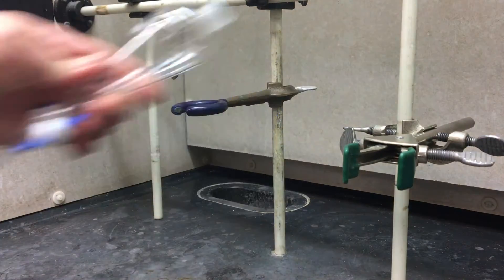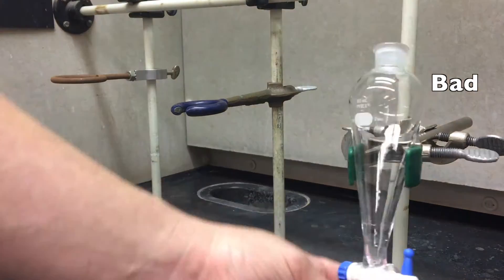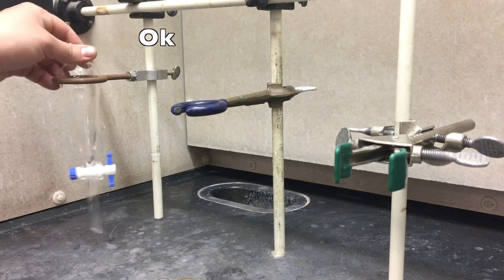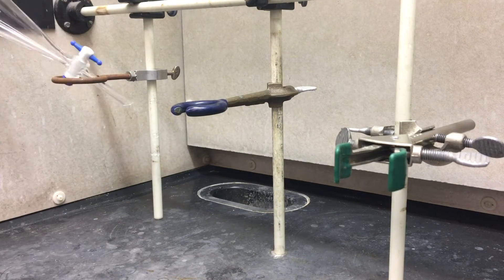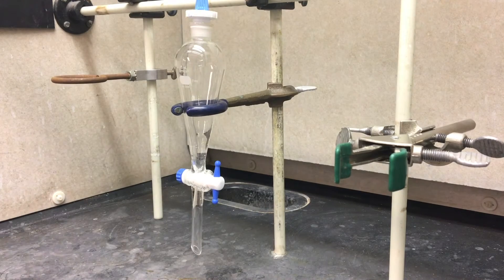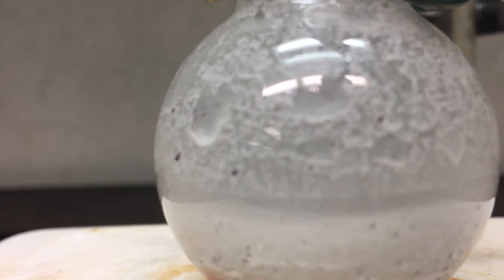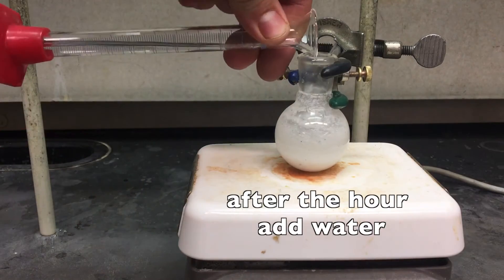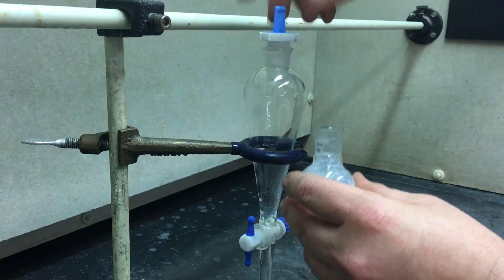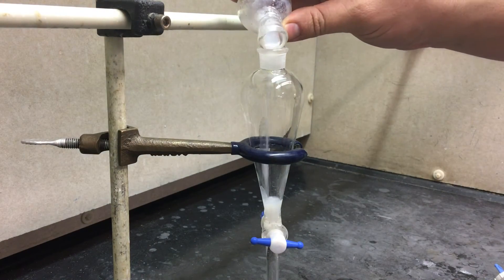While this is going, set up your separatory funnel. You have three options for a stand. The first is a clamp — that doesn't work, do not use that. The second is the small brown rings — those sometimes work. And the third is the small blue rings, which are the ring stands — those are the ones you want. Checking back in on the reaction, it should look pale white part way through the hour. At the end of the hour, you're going to add your next dose of water and then transfer your solution into your separatory funnel.